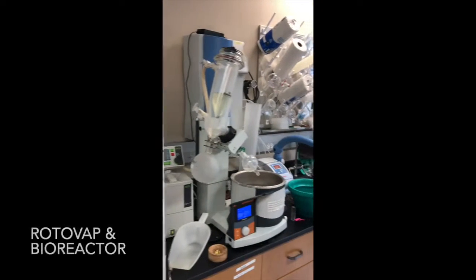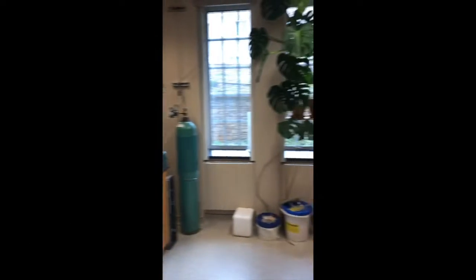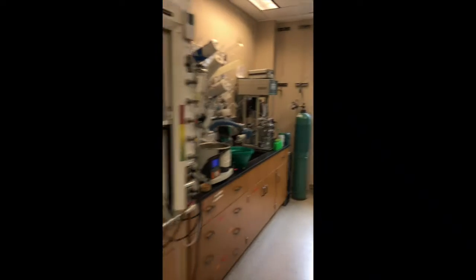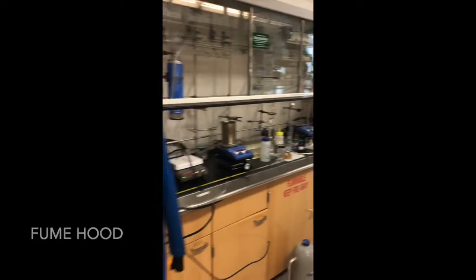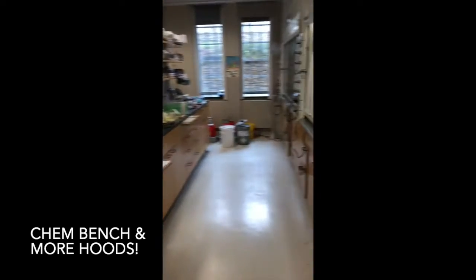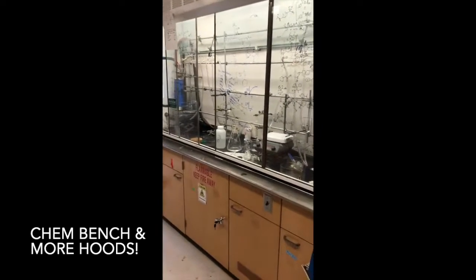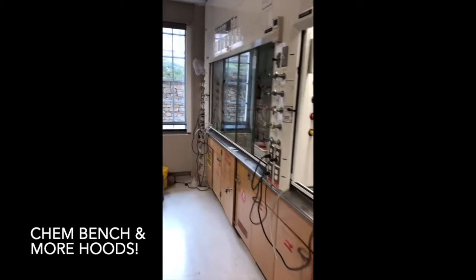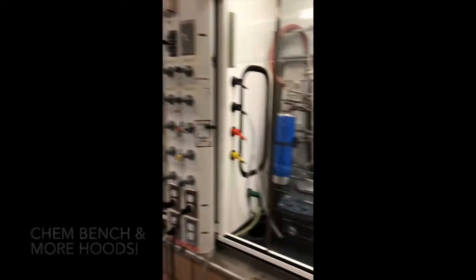Here we also have rotovap and bioreactor. Now you also see the first of our chemistry fume hoods. On the other side of this we see more hoods, more chemistry bench, all of these sorts of things that help the chemistry side of the lab operate.